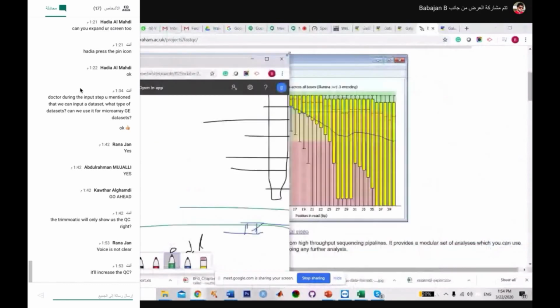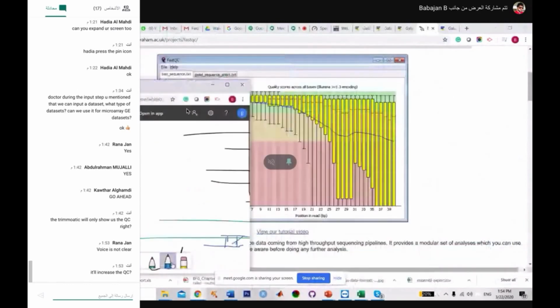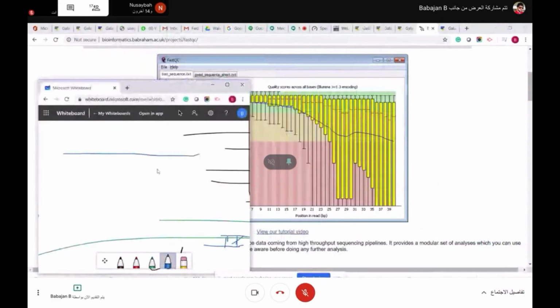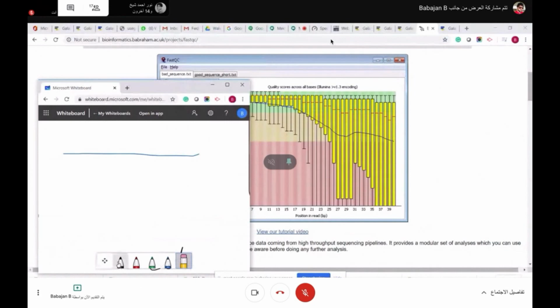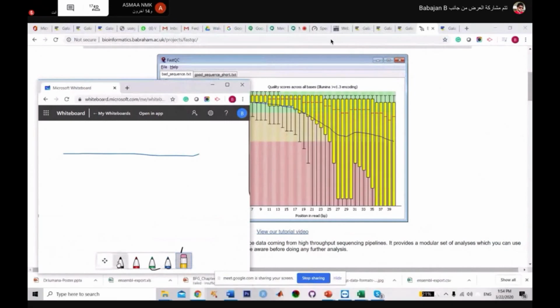Okay, so think that here we have a read. This is a read, from 1 to 40. Okay, this is a read 1 to 40.